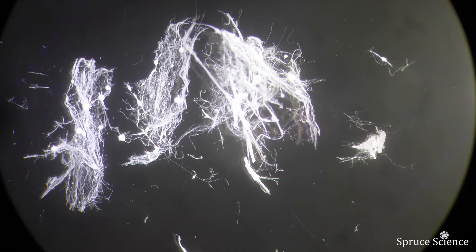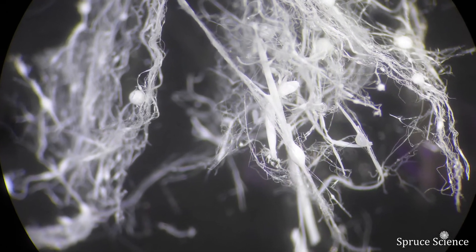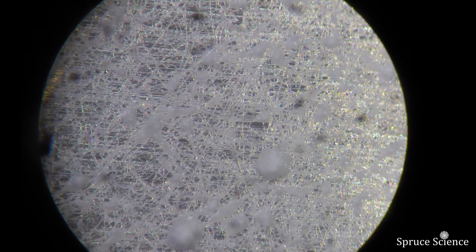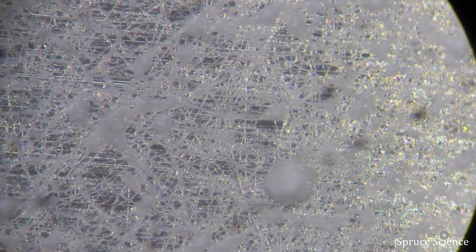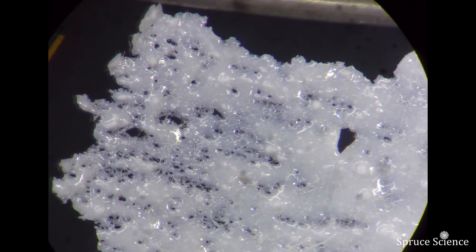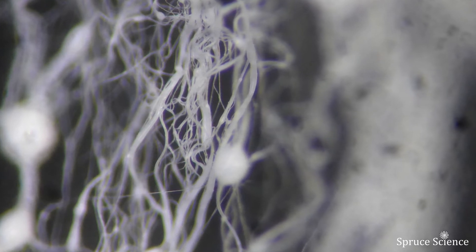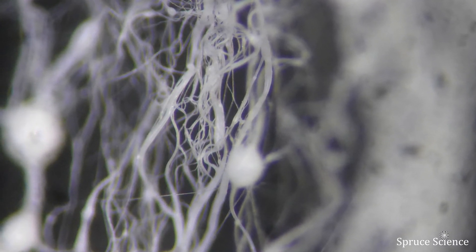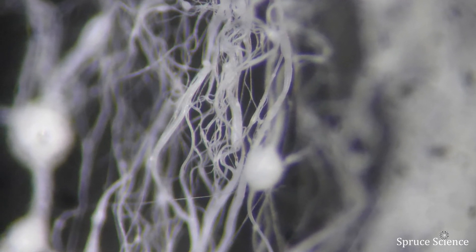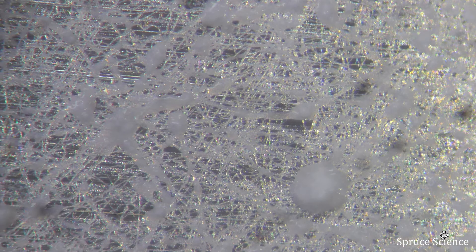Here are some microscope images of the composite fibers of PVP with zinc oxide. In some cases, the fibers fuse together after they dried on the collector surface. The dispersion of zinc oxide particles into PVP fibers can improve thermal stability and provide UV protection, since it reduces UV and visible light transmission. In addition, it can also enhance morphological and optical properties.